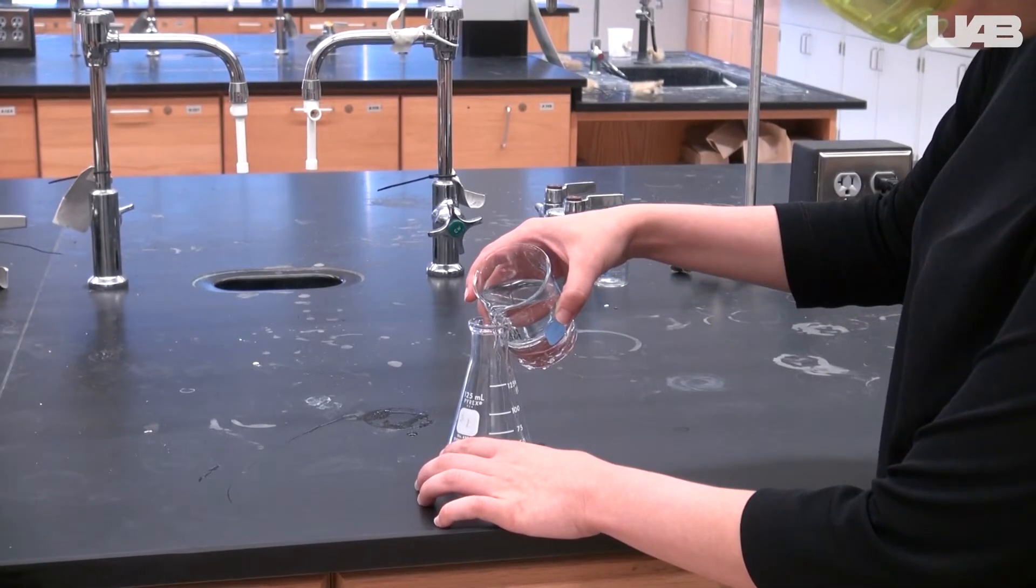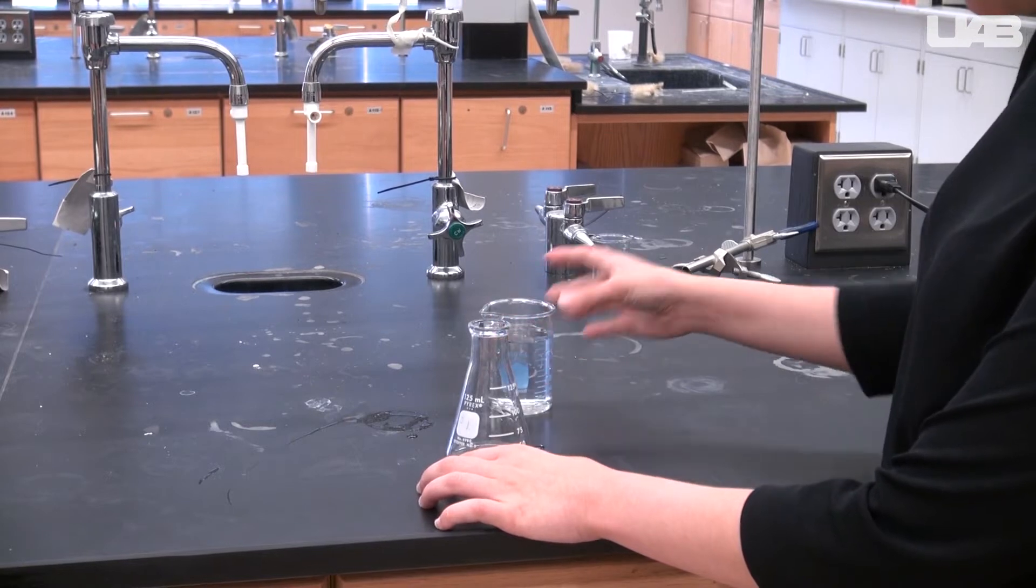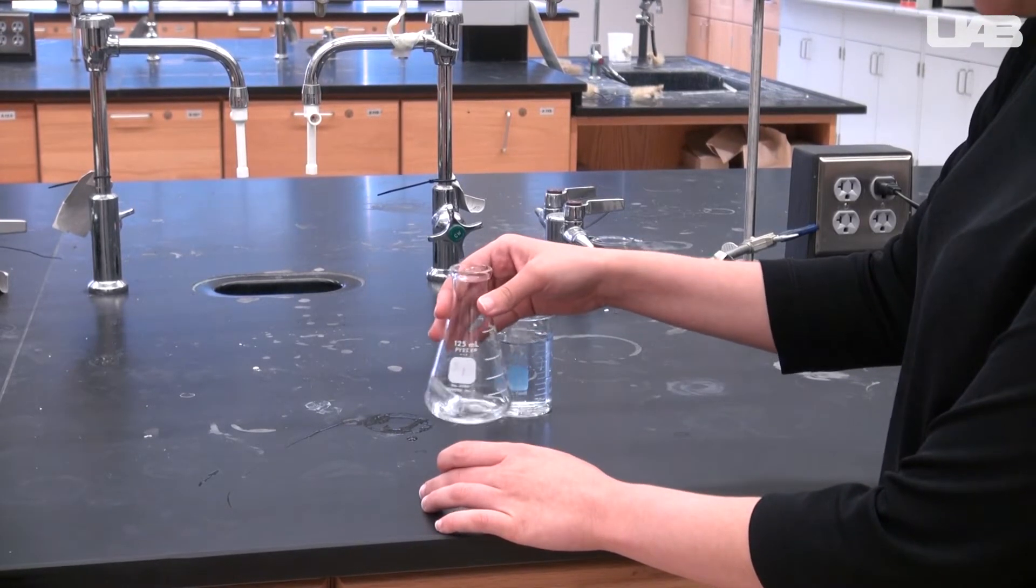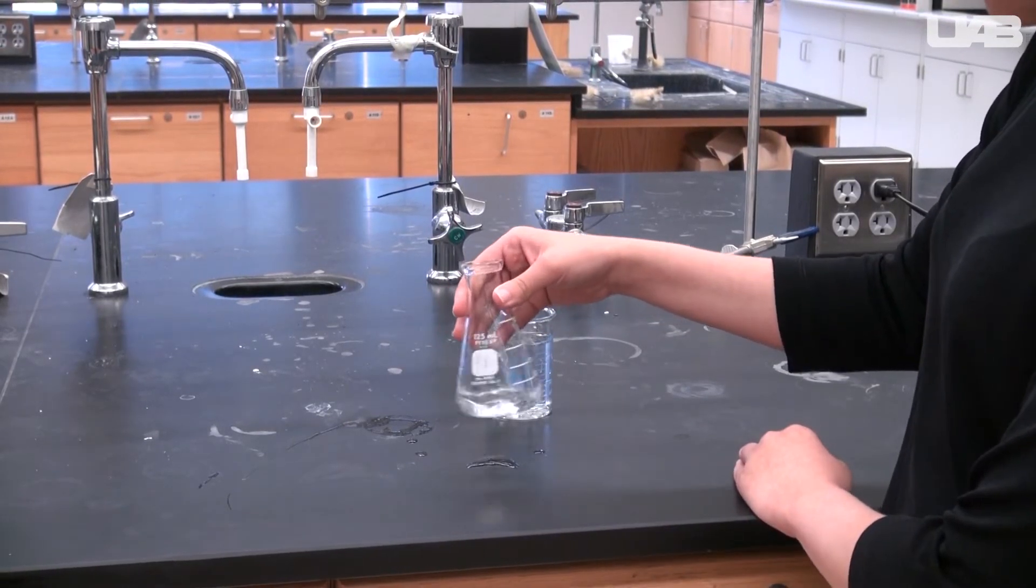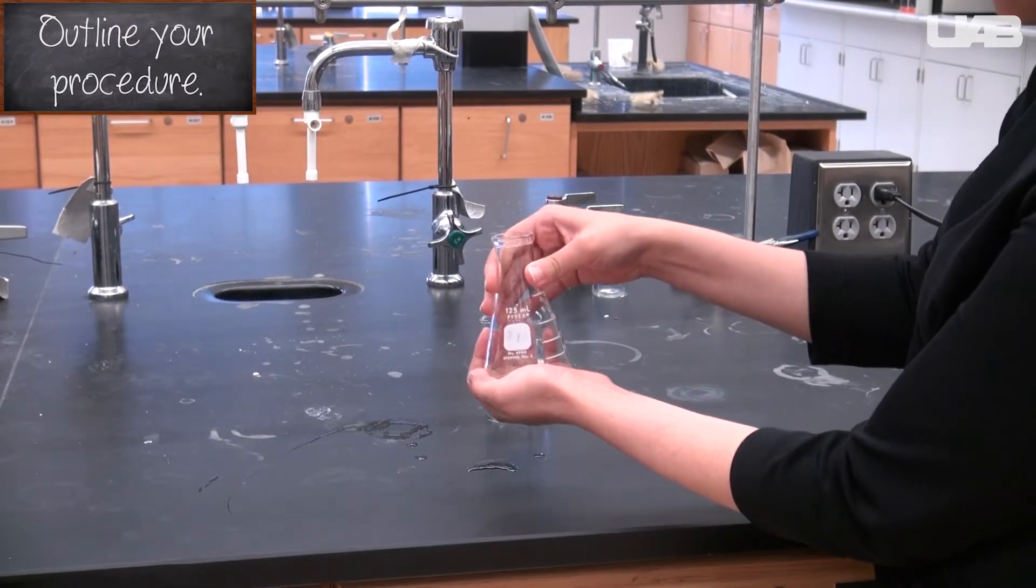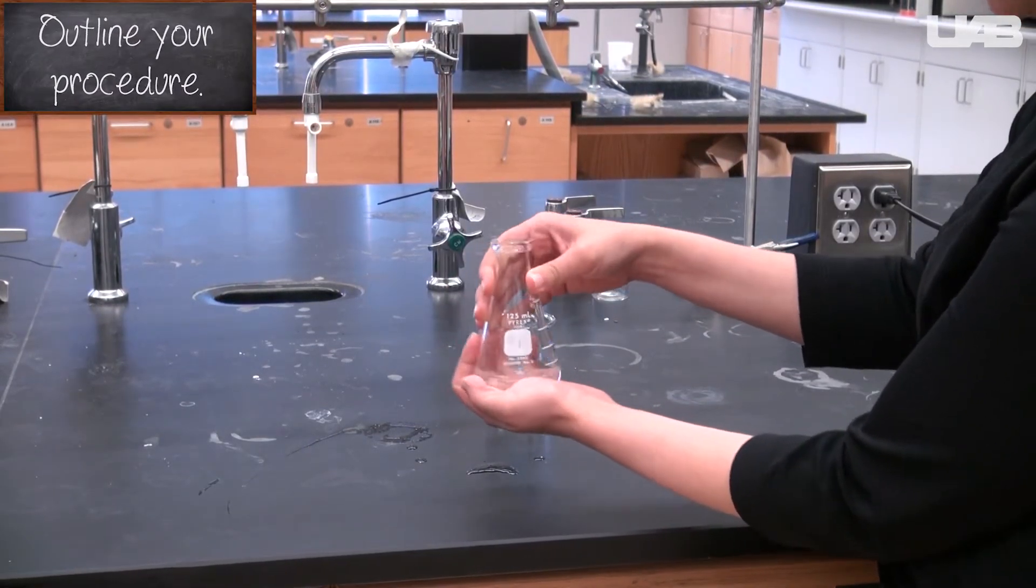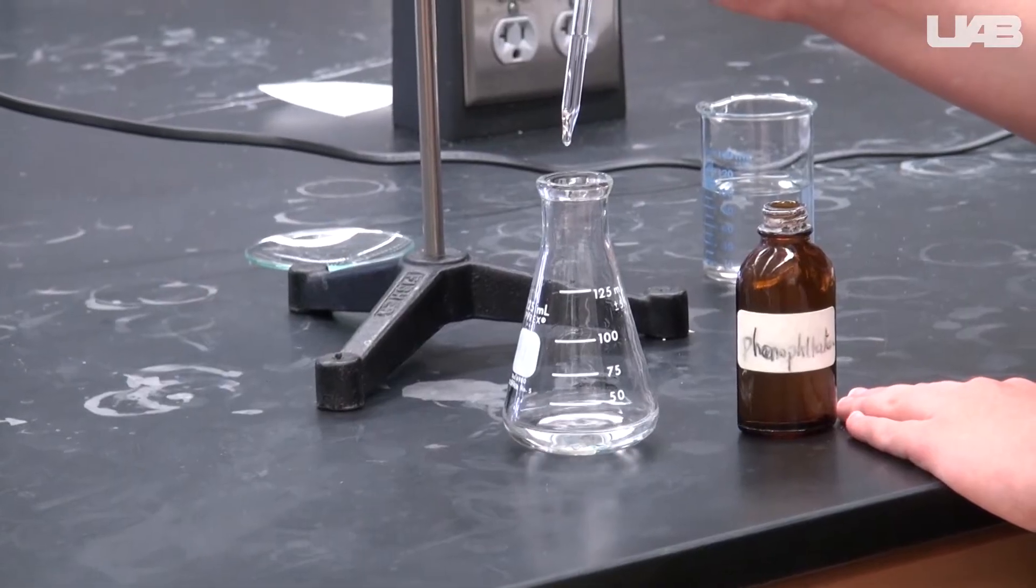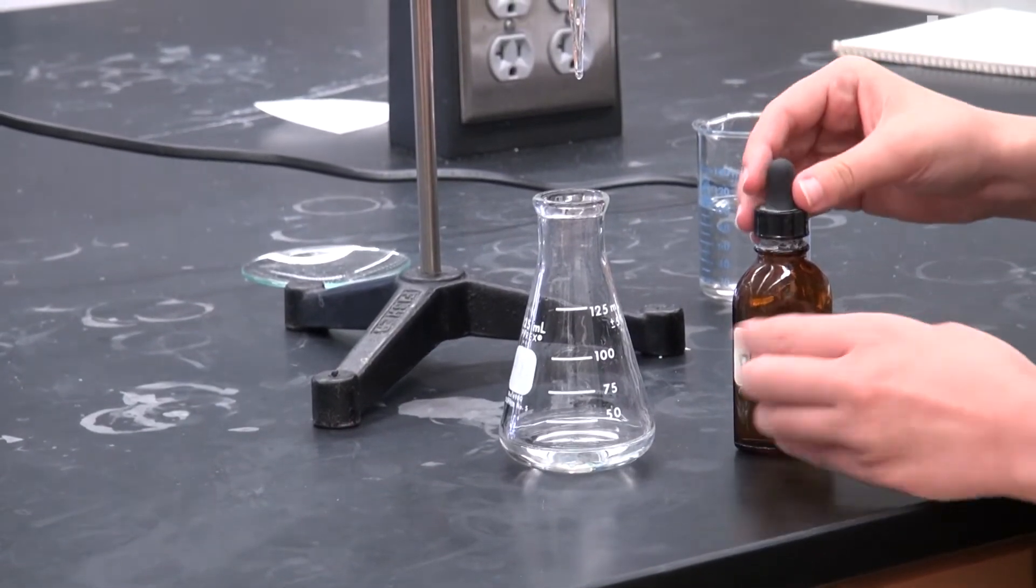Dissolve the solid in about 50 milliliters of water. KHP can take a while to dissolve, so prepare several samples at once so you don't have to wait as long. Cupping the bottom of the flask with your hand will help it dissolve. Once it has dissolved, add one to two drops of phenolphthalein.